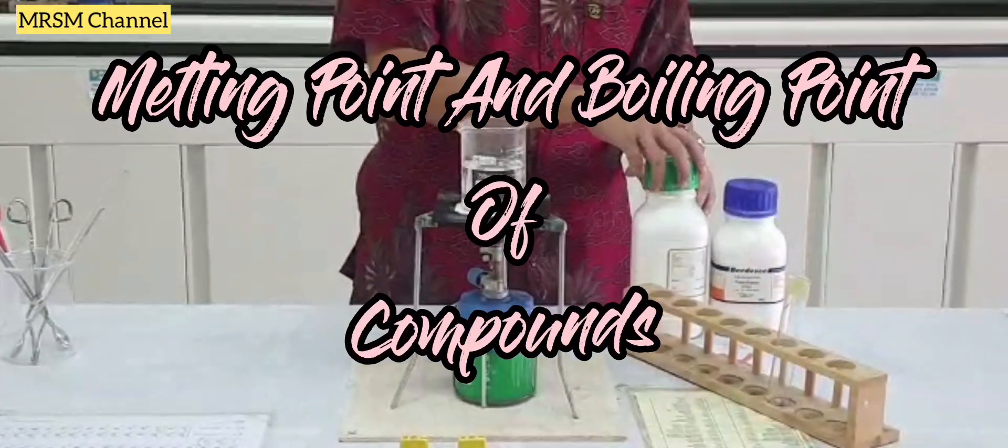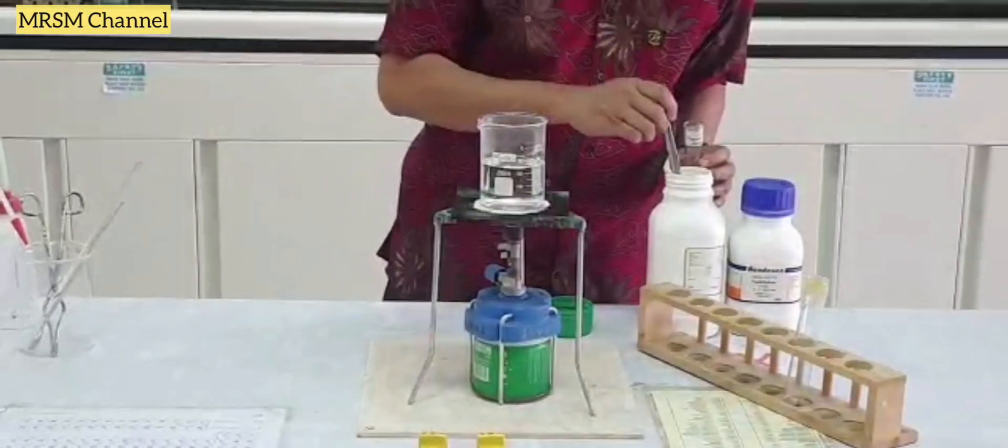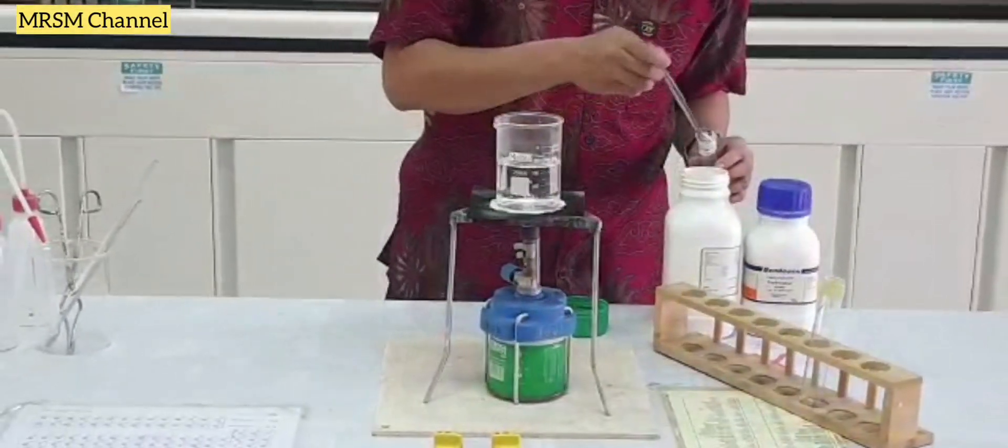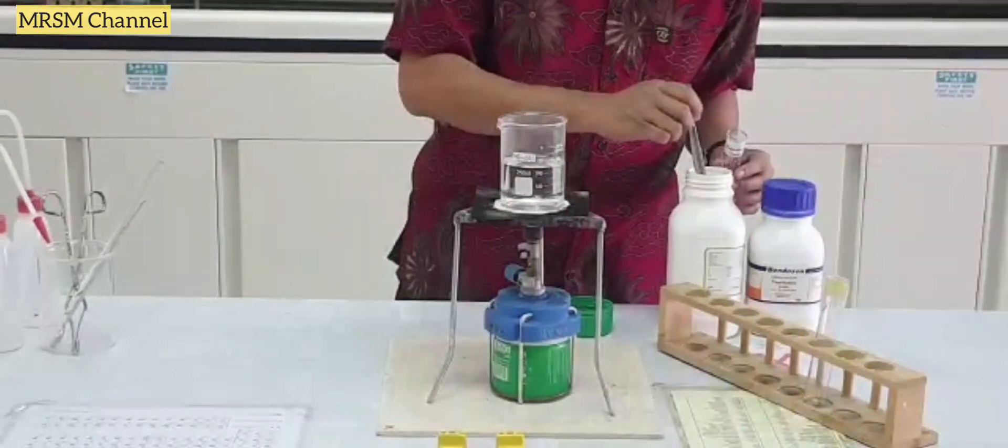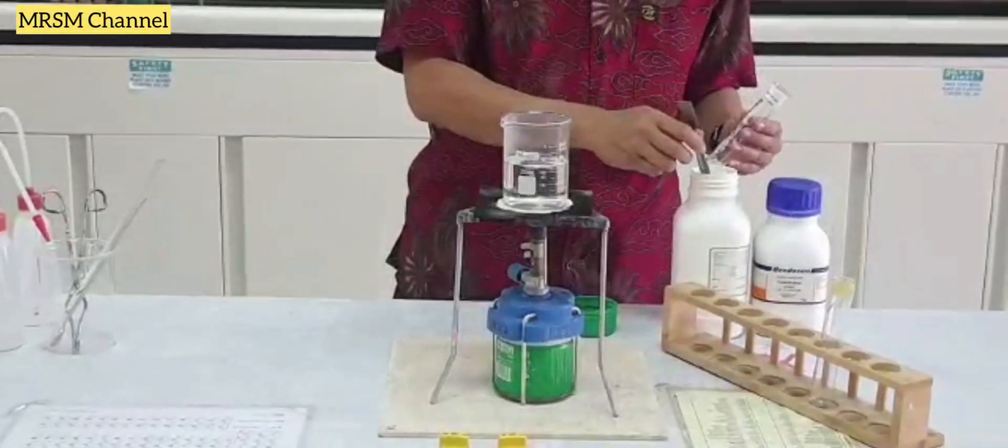Hello everyone, today we are going to do melting point and boiling point of a compound. So first I take some of the magnesium chloride into a boiling tube using a spatula.